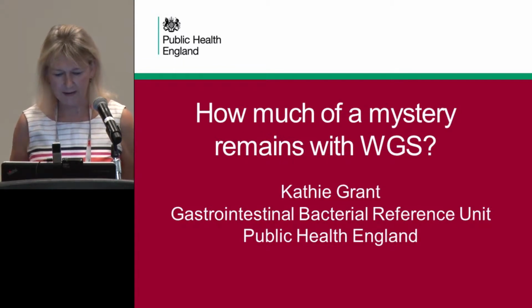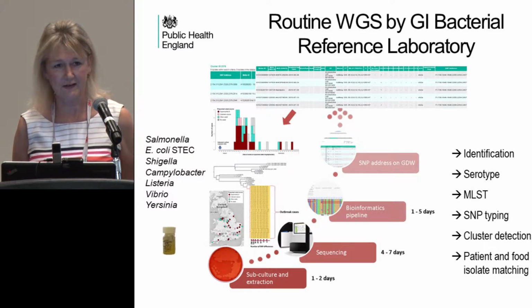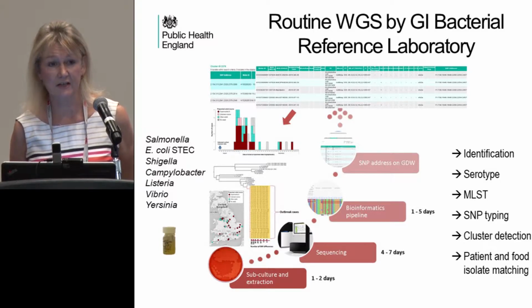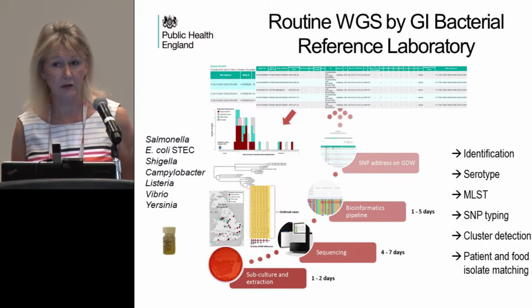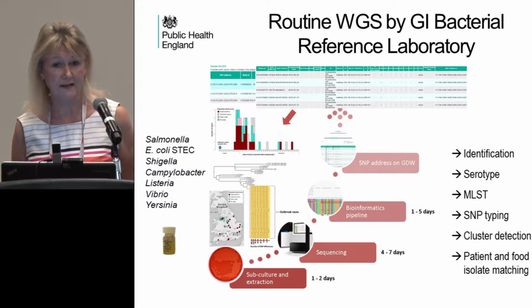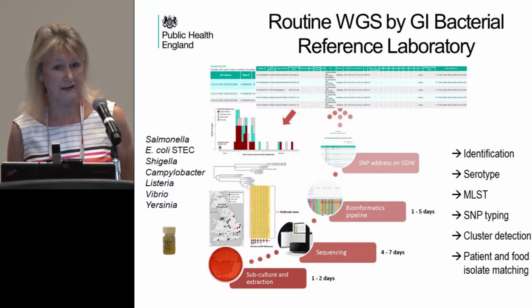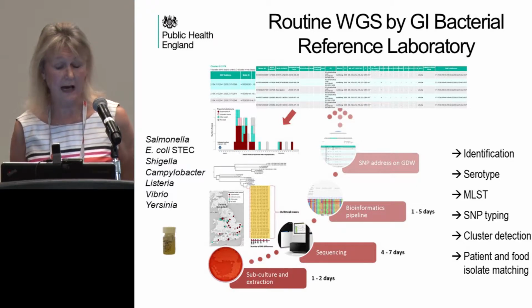As you've heard, I'm from Public Health England, and we are using whole genome sequence analysis routinely to identify and characterise the isolates that we receive, both from clinical cases of gastrointestinal disease and also from food isolates that are referred to the laboratory. We are quite lucky in that we get both clinical isolates and food isolates, taken either routinely as part of testing or as part of investigations.